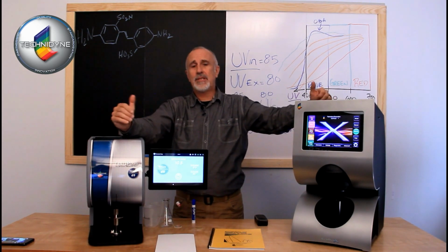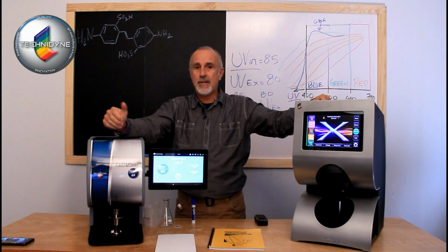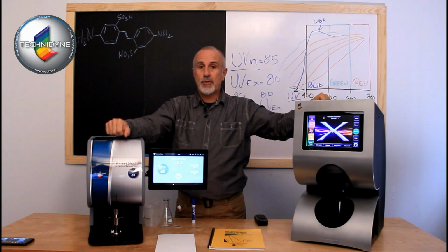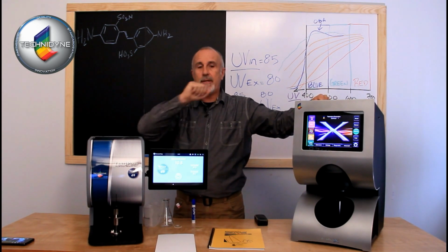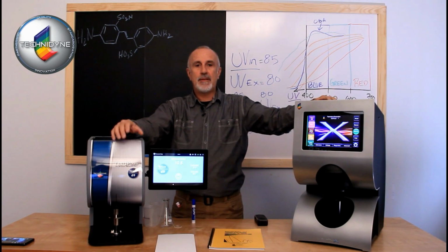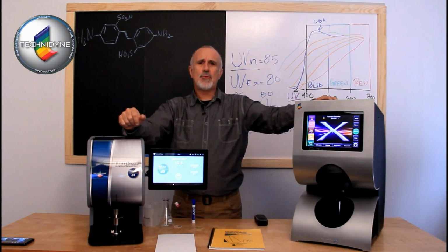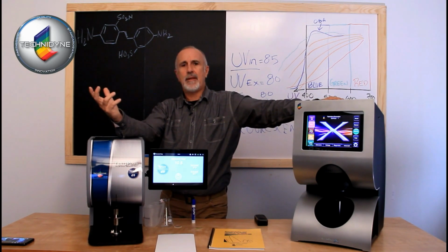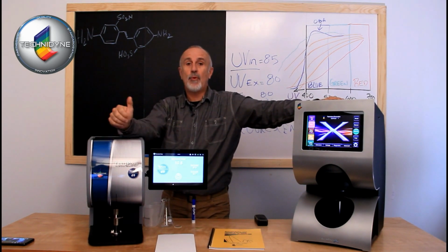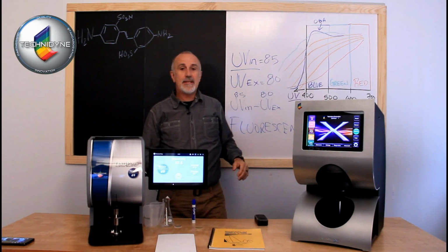So the ISO committee went back to work on how do we manage this. And so they standardized on a new light source, which they called source C. And source C was going to represent this typical viewing environment. Turns out source C is a bit more UV energy than the QTH lamp was, but it was quite a bit less than where the D65 was.